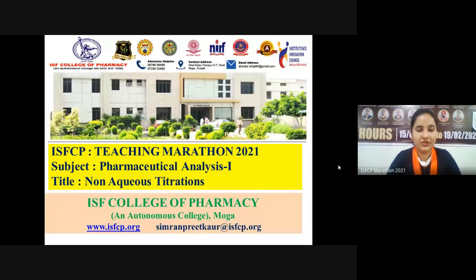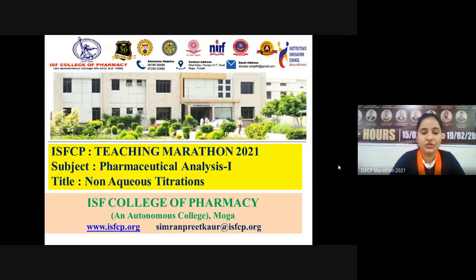Today we will continue the next lecture of pharmaceutical analysis. The next topic of unit number 2 is non-aqueous titrations. So far we have studied aqueous titrations. All those titrations which we have studied till now were taking place in aqueous medium.